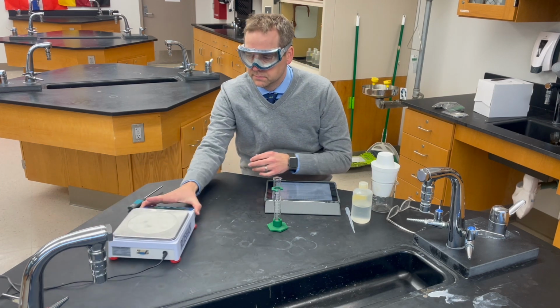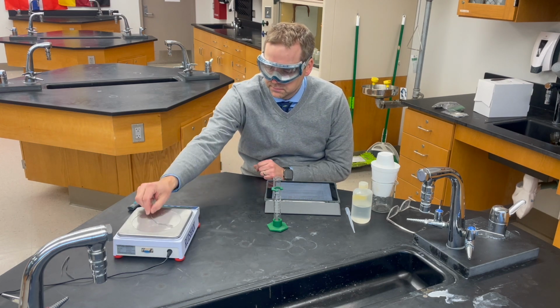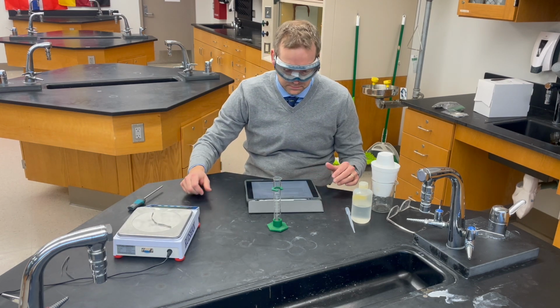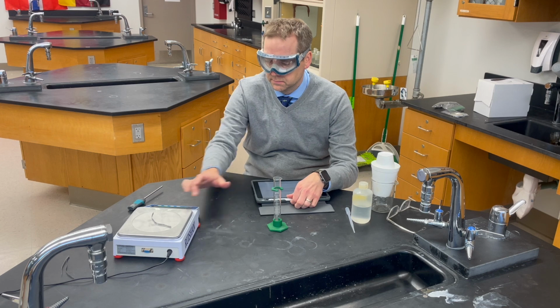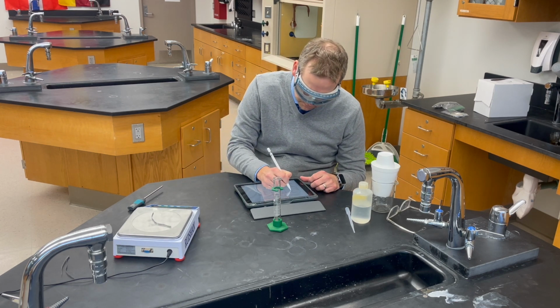I've got all my materials here, and the first thing I'm going to do is find the mass of this magnesium strip. I'm going to put it on the balance and write down the actual mass. It should be about 0.25 grams, but I'm going to write down the exact amount here in my data table.